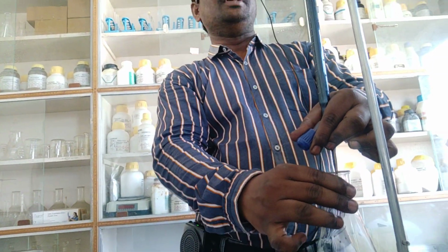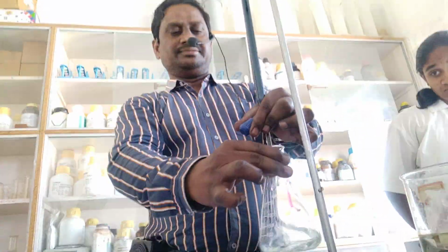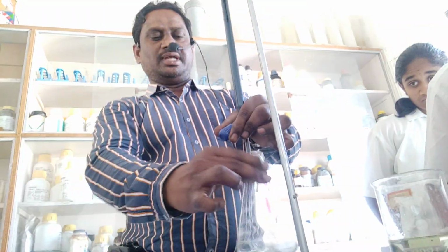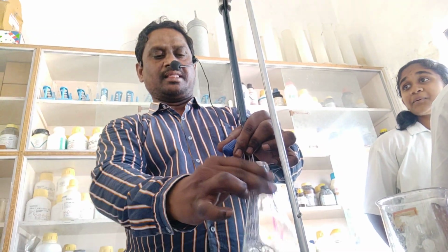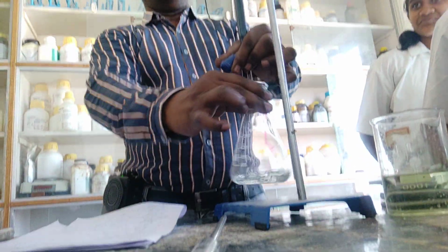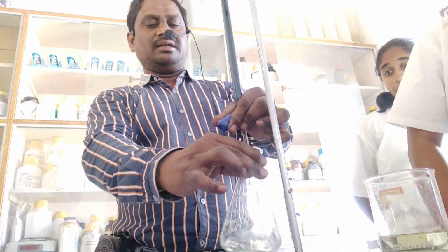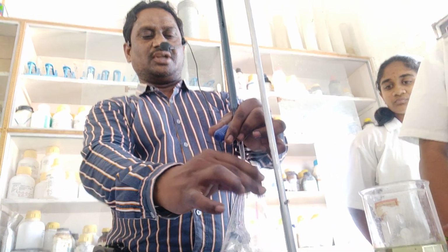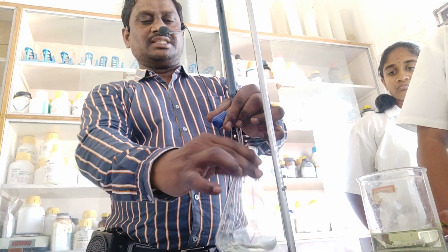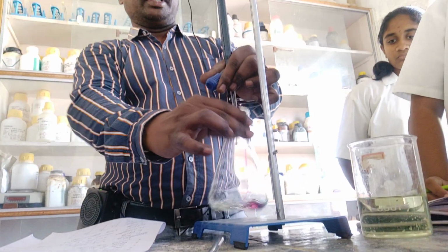Slowly, just drop wise you release. Don't release fast, just drop wise slowly. So like this you have to shake the conical flask. Up to then we have to perform this experiment, until this colorless changes into what? Pale pink. Up to then you have to perform slowly, just drop wise only release. Suddenly it will change. At that particular point you have to note down carefully.